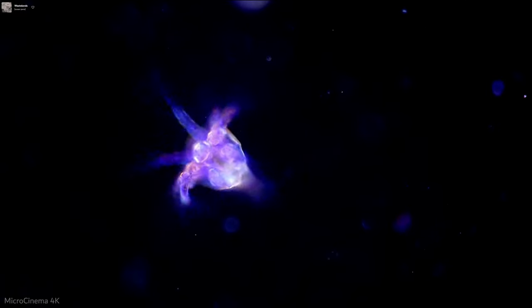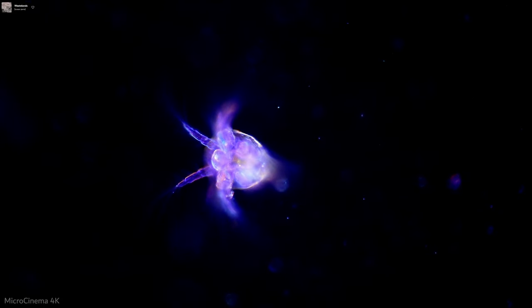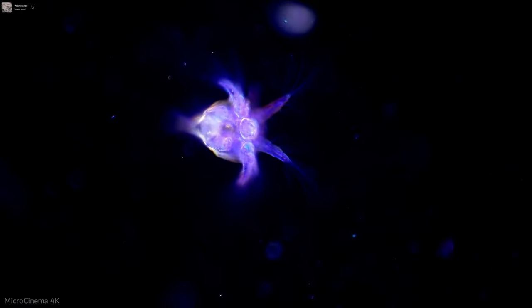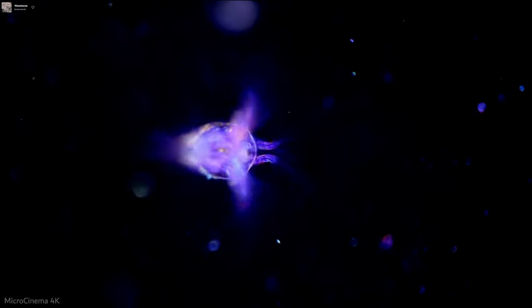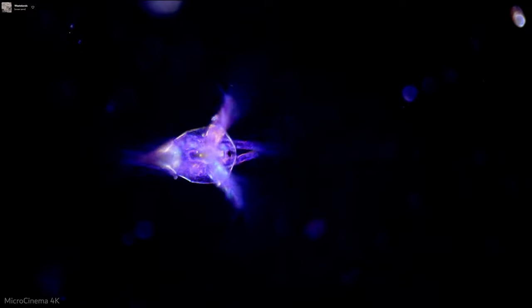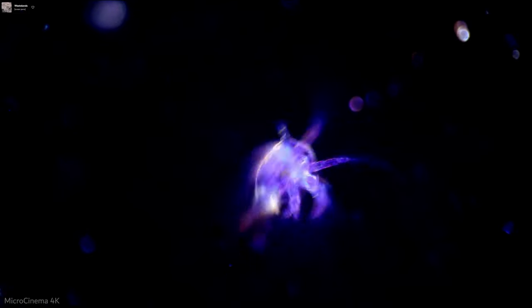If you're ever trying a technique like this, I should back up here. When you do dark field and polarized light with crossed polarizers, you're really cutting out a ton of light. And this is a very low light technique. That means it's going to be difficult to capture good video of it. I have a very high end camera and I'm at ISO 16,000 right now. This is pretty up there.